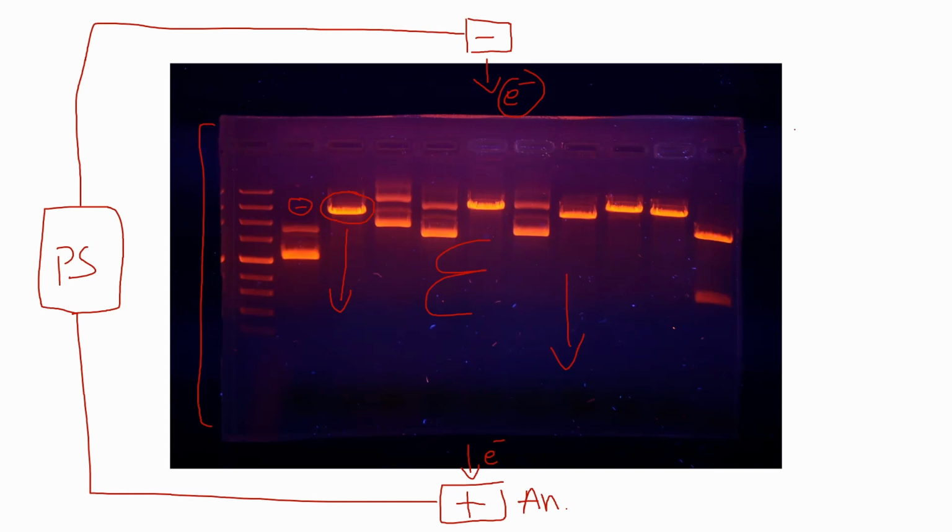As for the electrophoresis theory, our understanding is that the velocity of any of these molecules within these samples, obviously this band right here would not represent a singular molecule, it would be many molecules. For example, if this is DNA, it would be many DNA sequences that are in here of the same size.